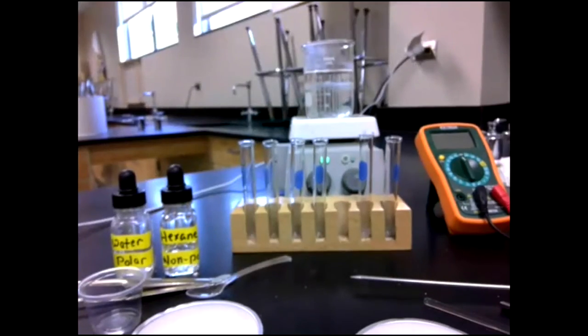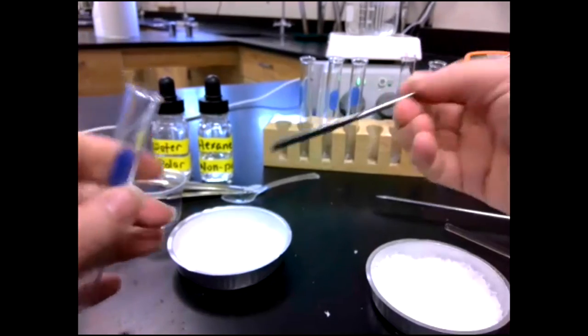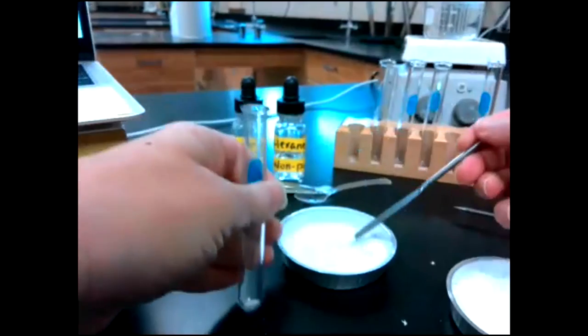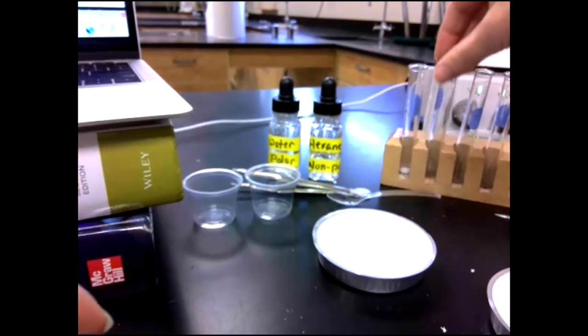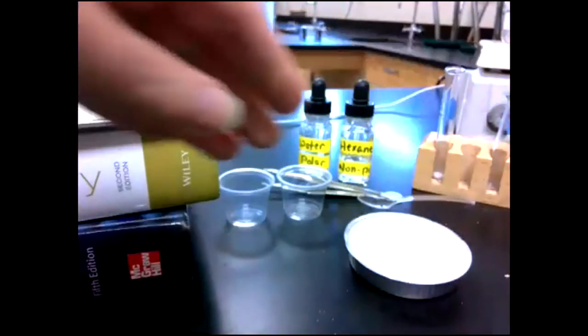So we're going to put these in test tubes. And I'm not going to use a whole lot. If I use a lot of stuff, then even if it's soluble, it won't look soluble. It won't all dissolve. So I'm just going to add about the size of a pea. That's A. And these aren't labeled, so I'm just going to do them in order. So that is A. I'm going to do A and B both in water first. And I think that this is the order in your lab. So there's B. Do a little bit more. B is really fluffy, so it looks like not as much, but it's actually okay.